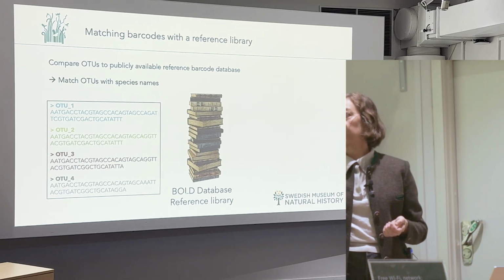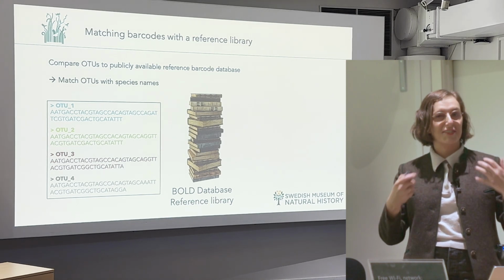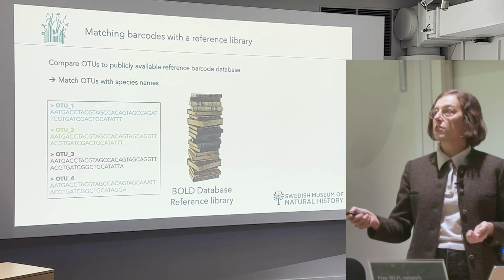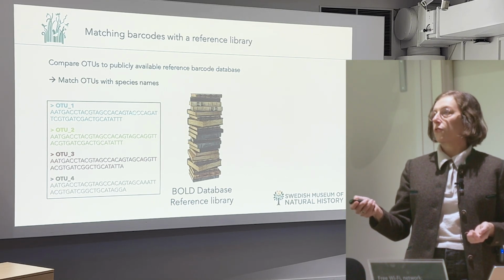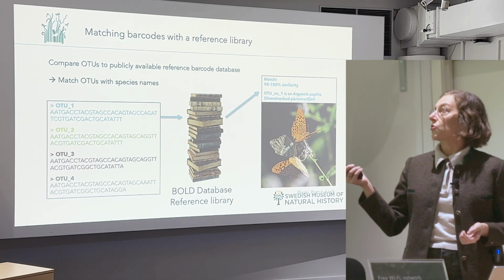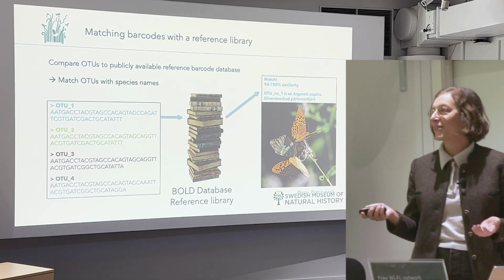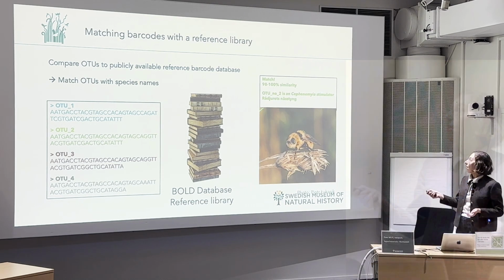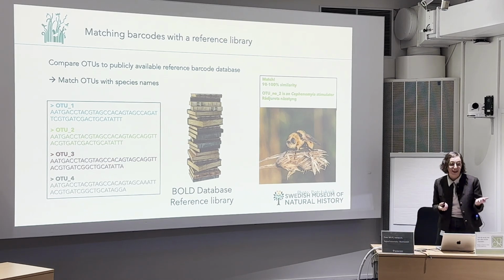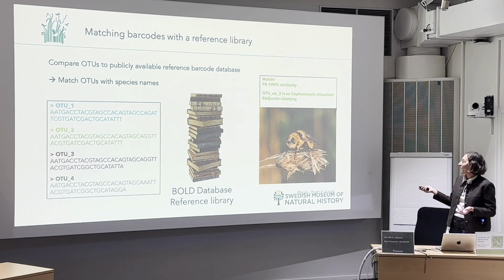So there's a huge database of barcode sequences. A lot of people sequenced a lot of barcodes, and they know what those barcodes are. So we basically compare our sequence to the reference library, and let's say for the first, the blue sequence, it matches at 98 or 100%, it matches this beautiful butterfly. Oh, we had a butterfly in the sample. How wonderful. So let's look at the second sequence. What is this? Oh, this one matches this furry little guy. So we didn't even have to see him. We just sequenced the bath water, right? And he left a little bit of DNA there, and now we have him.